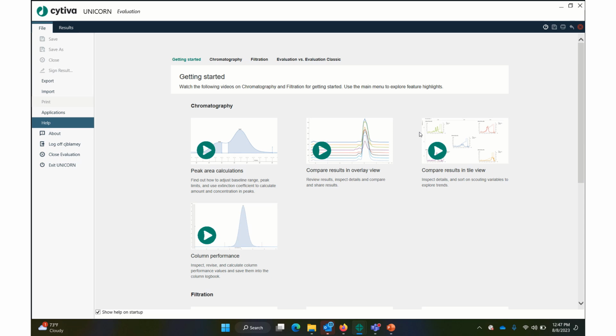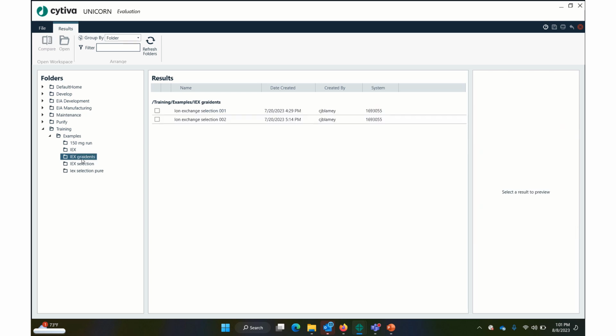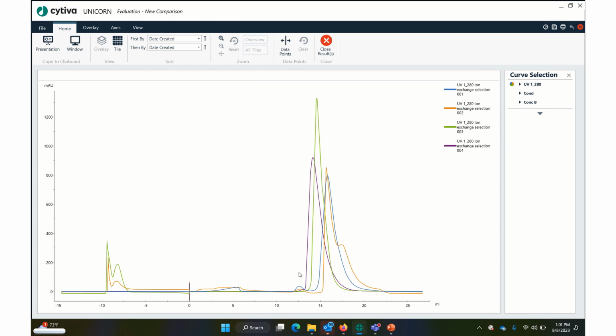Okay, so we just finished the run. It took about 45 minutes. Let's look at the results. We're going to do this by selecting this first result right here, and we're going to hit shift, and then select the bottom one, and that's going to highlight all 4 of them. We'll hit this compare button, and this will open all 4 at the same time, and it takes Unicorn just a minute to open these. Okay, so here's all 4 runs.